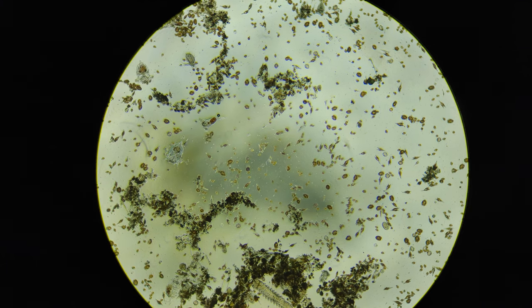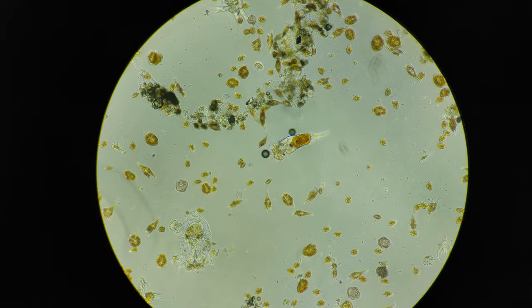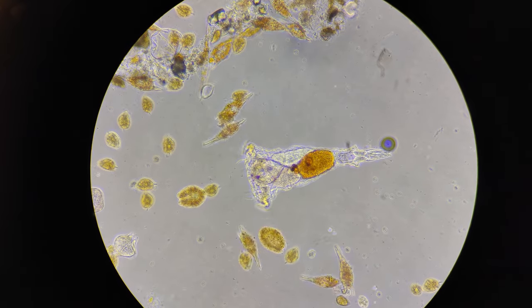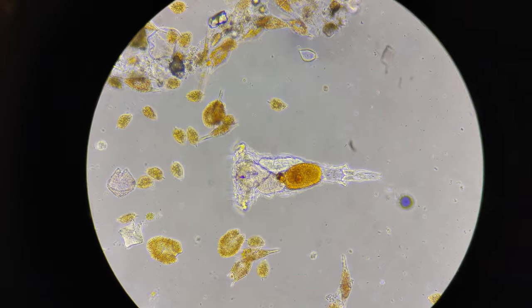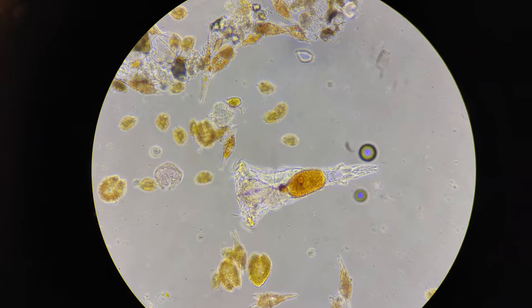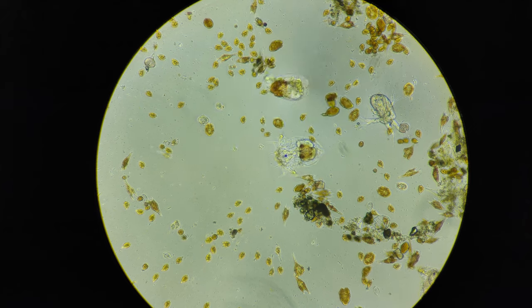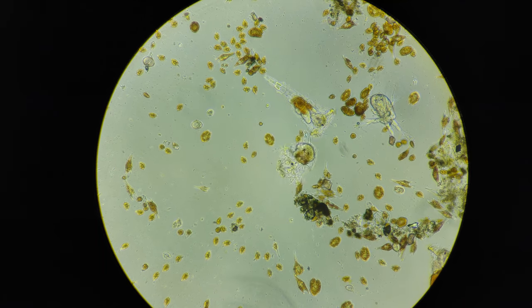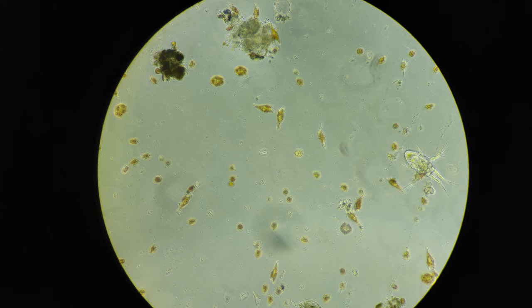And just a lower magnification of the sample. Here's another type of zooplankton and a rotifer. It's really amazing how complicated their internal structure is and how fine the details are. More zooplankton feeding on the diatoms and dinoflagellates here, and a few different types of copepods — you can see they all have different strategies for moving around.